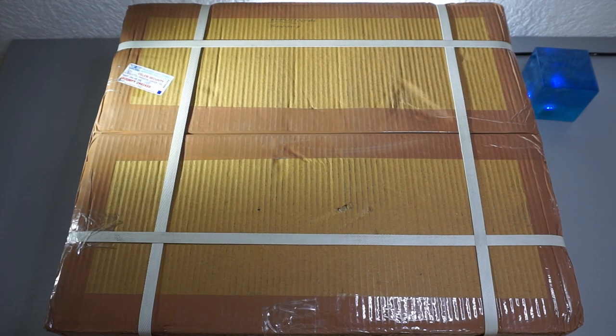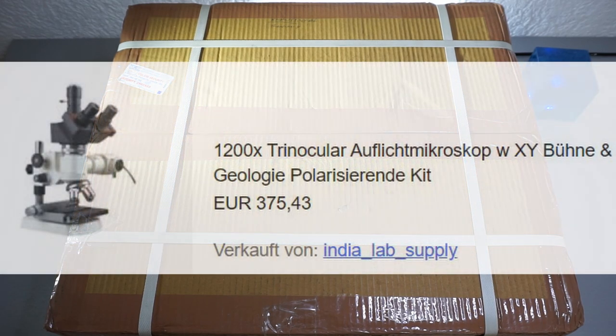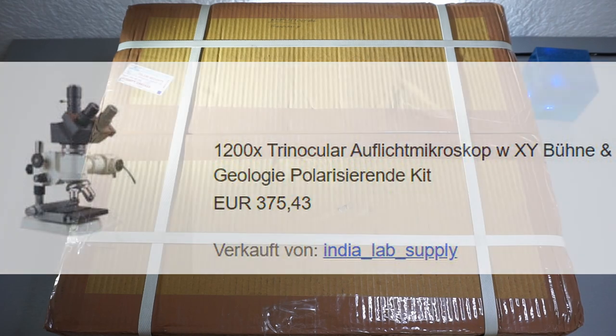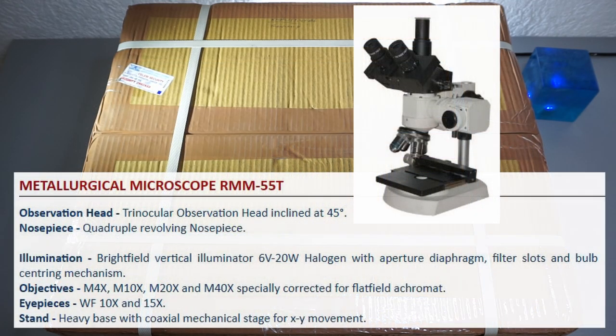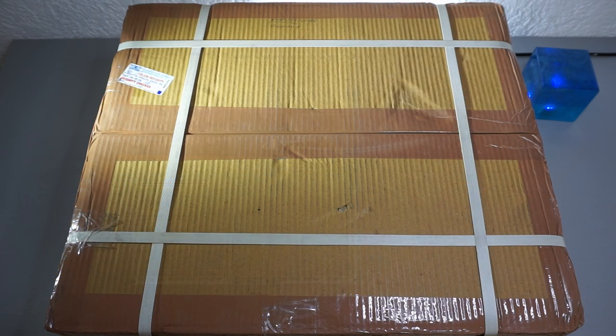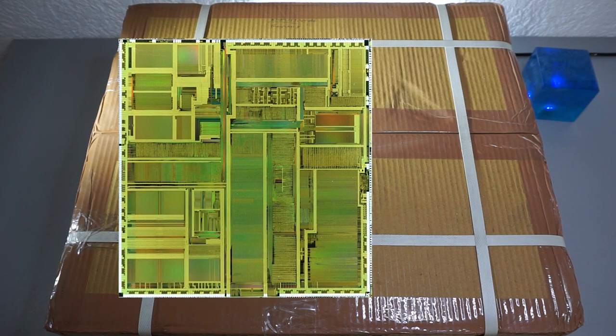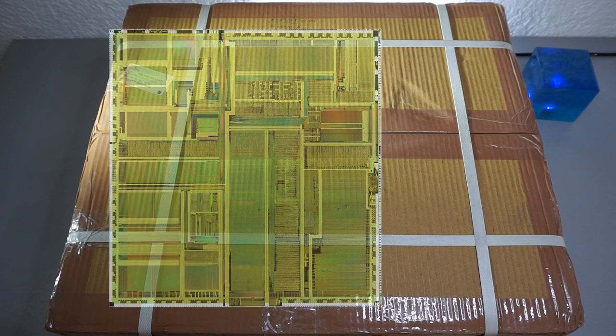Before we are starting, I would like to explain which microscope I was buying. This is a 1200 times magnification top light microscope with an XY stage and a polarizing unit. It's a metallurgy microscope and I will explain the technique a bit later. I wanted to make sure this is a specific one which fits my ambitions and my desire to look at CPU dies with high magnification and observe the transistors, the microstructure of these CPU circuits.